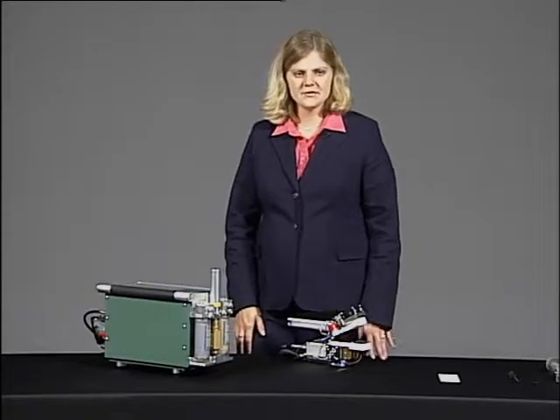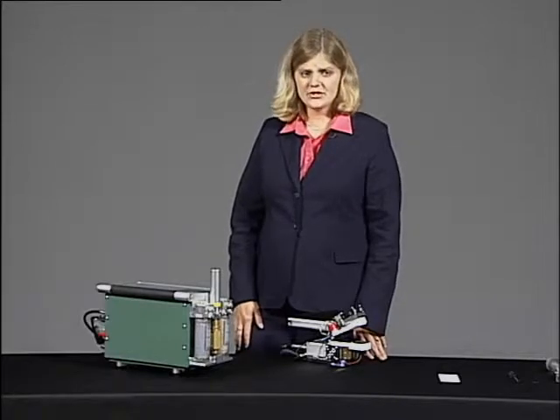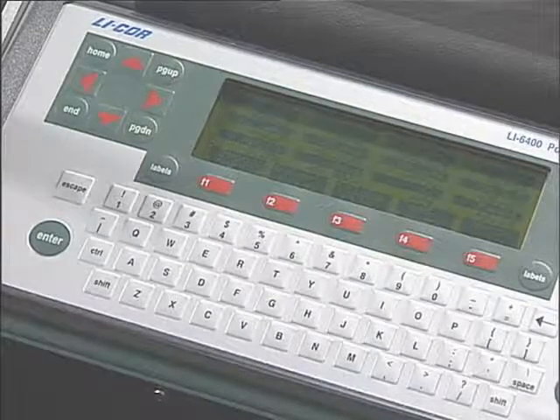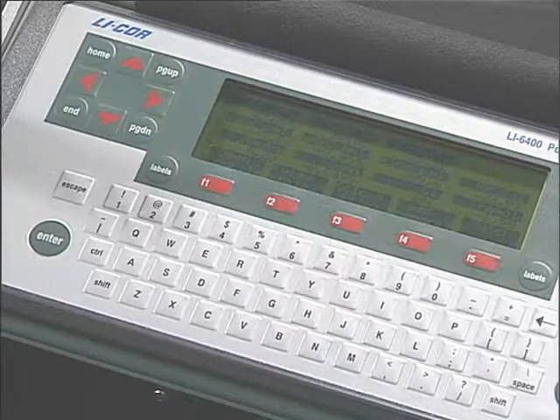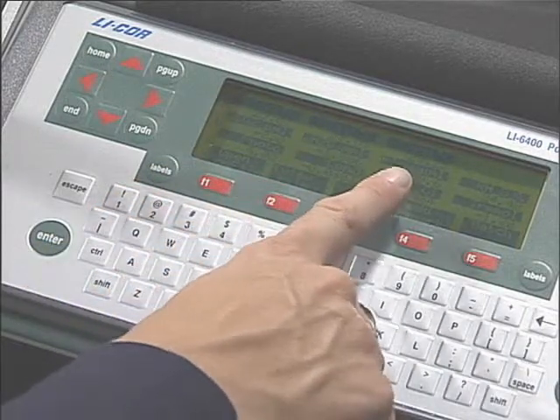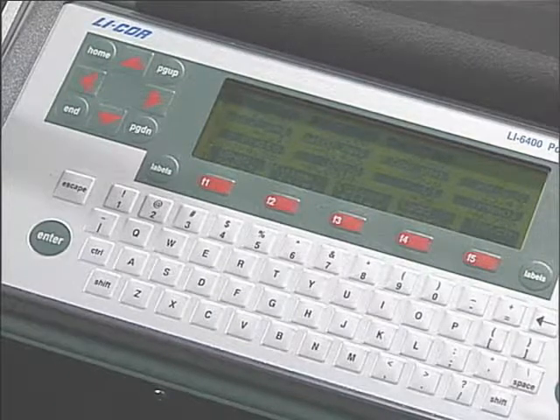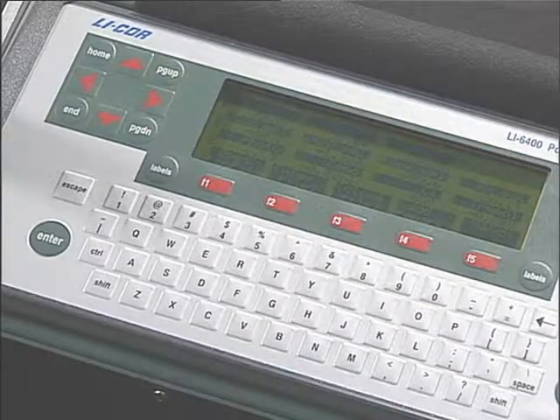And the very first point of this daily preparation checklist is to check your temperatures. And we want to put line H up on the display. And H contains all of our temperatures, our block temperature, our air temperature, and our leaf temperature. And those sensors are located in the sensor head. We just want to make sure that the temperatures look reasonable.